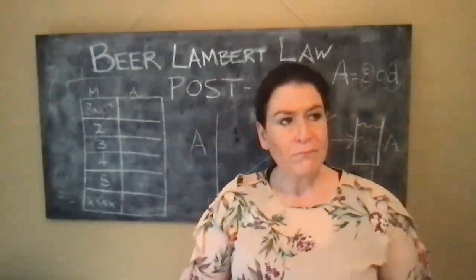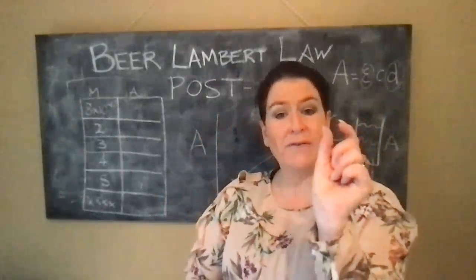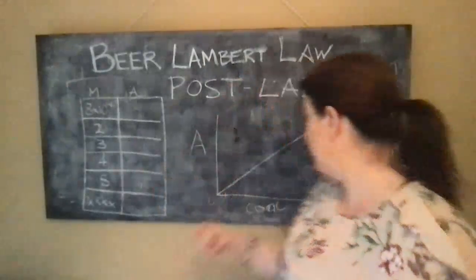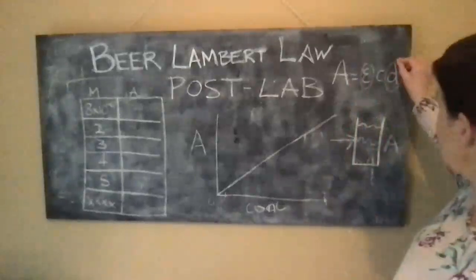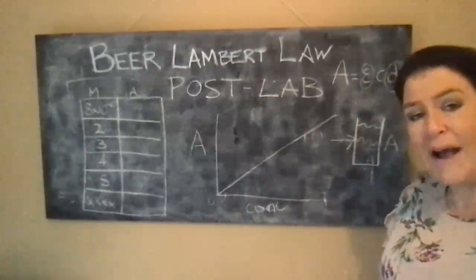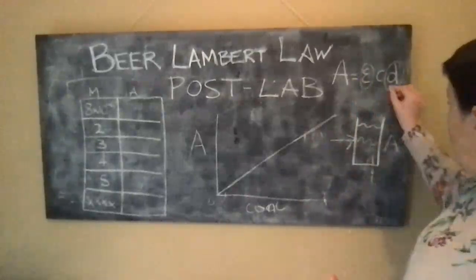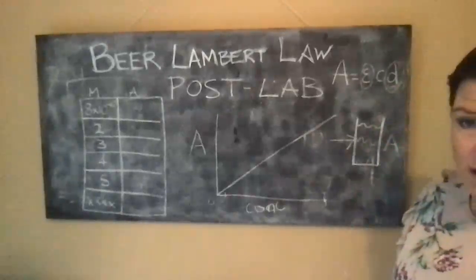Now, luckily, some genius, when they were designing the spectrophotometers, made those little vials that you put your solution into, that look like this, all have a dimension of 1 centimeter. So D here is always 1 for us, and that makes things quite easy. But it's important to recognize that we have to take it into account, and we have to know what's going on with it.